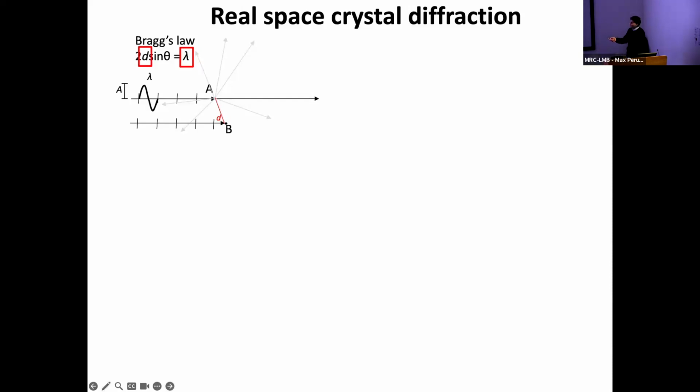And we have our coherent beam. Of course, the X-ray beams need to be coherent, parallel, coherent, which means all the beams, all the waves need to be in phase with each other, okay? As you can see, these are all in phase with each other. Now let's say B is sitting by A, and it's also scattered in all directions.